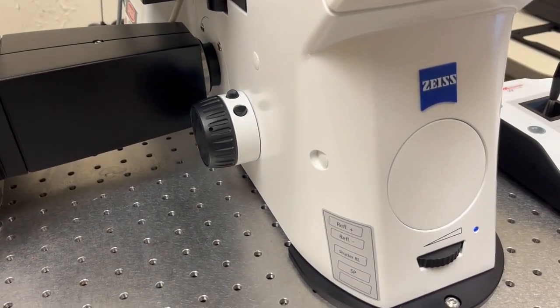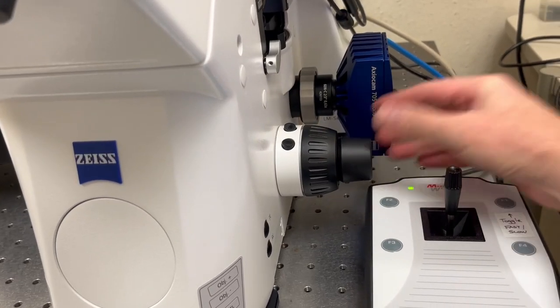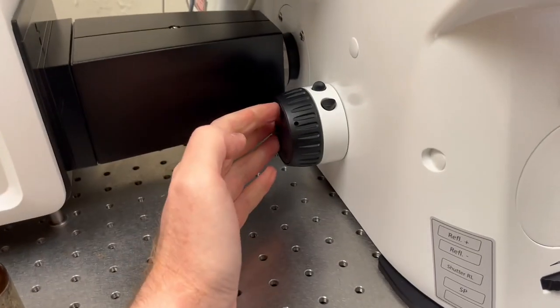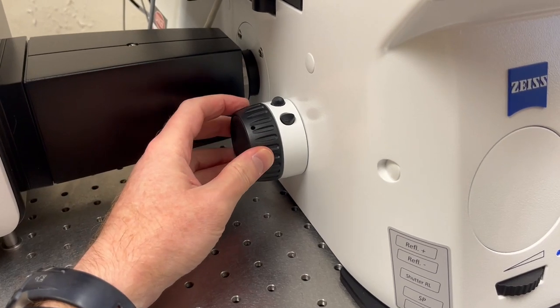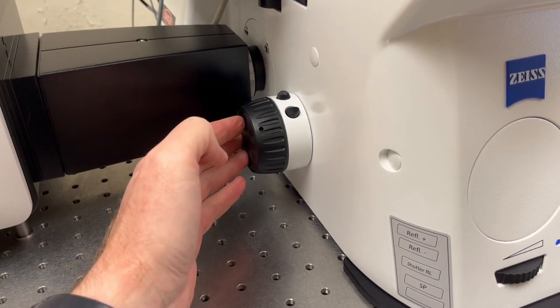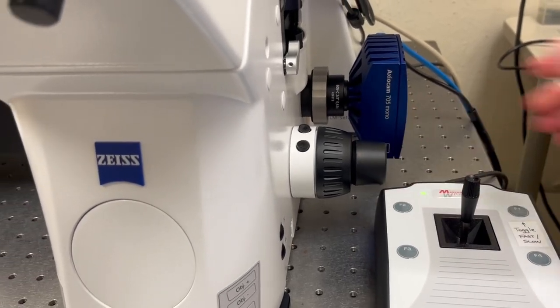The difference between the outside knob and the inside knob is that the big knob moves it a lot, so it's a coarse focus, whereas the inner plate or inner knob moves it more subtly, so it's a fine focus.